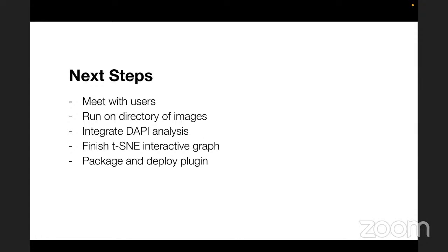Any questions? So the thing is running on the image pixels based on some representation from the model that you get. It's running on the features that are outputted from the model. I'm not totally sure what all of those are, but that's what it is running on. Yeah, he would know more about this.